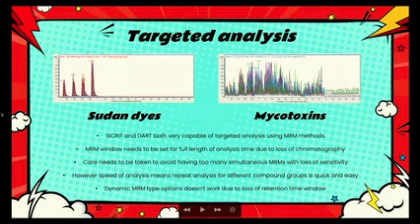Unlike in normal LCMS-based mass spec, where you work out your retention time for your analyte of interest and set your retention time window for your MRM, with ambient and direct injection you set the MRM window from the start to the end of the run, and you look for those parent and fragmentation pattern daughter ions throughout the whole run.